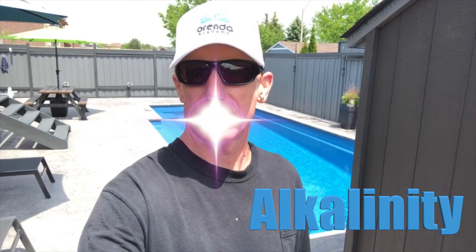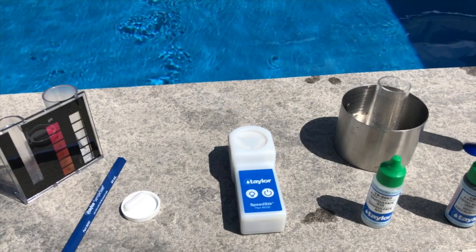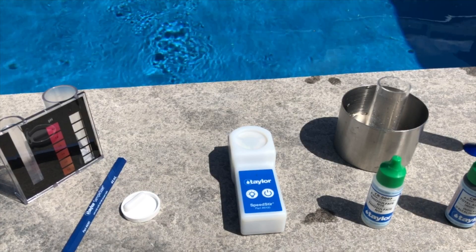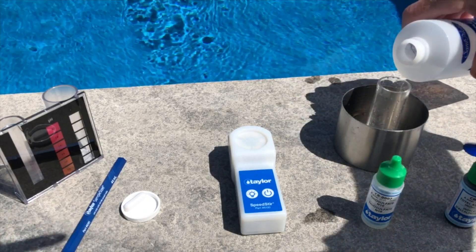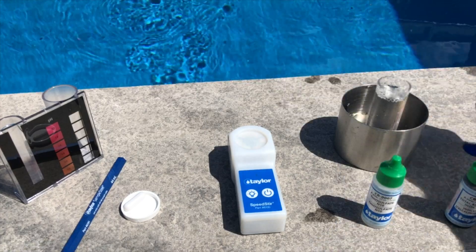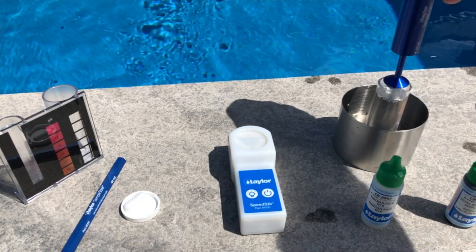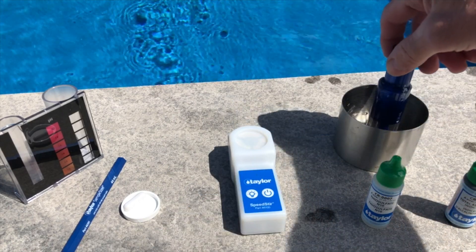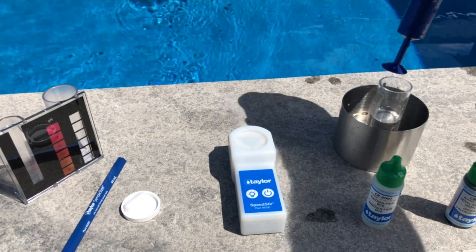What's up YouTube, Charlie C here with ABC Pools. Today I'm going to show you how to do a test with the Taylor test kit for alkalinity. Let's start our Taylor test for total alkalinity. We'll take our pool sample we collected, fill the tube, and use the Taylor sample sizer to displace any extra water, leaving us with an exact 25 milliliter sample for the test.